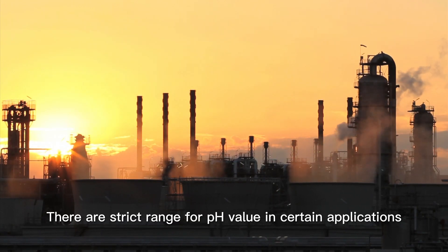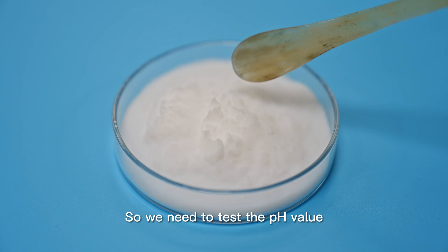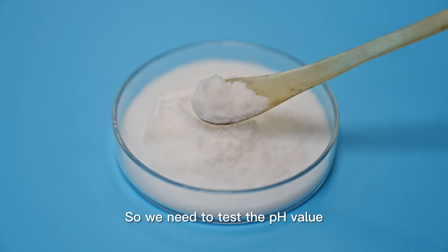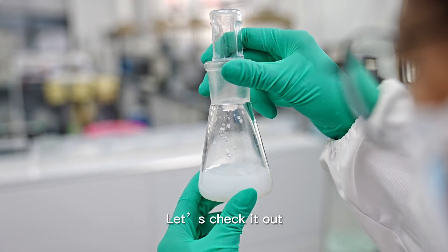There are strict ranges for pH value in certain applications or manufacturing processes in the chemical industry, so we need to test the pH value to see whether it meets the required standards. Let us check it out.